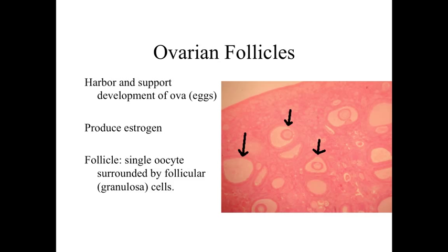When we take a look at an ovarian follicle, we're going to see a single oocyte — an enlarged cell with a fairly euchromatic appearing nucleus and a distinct nucleolus — surrounded by what are referred to as either follicular cells or granulosa cells. These are much smaller, more basophilic staining cells immediately surrounding and supporting the egg as it's developing.